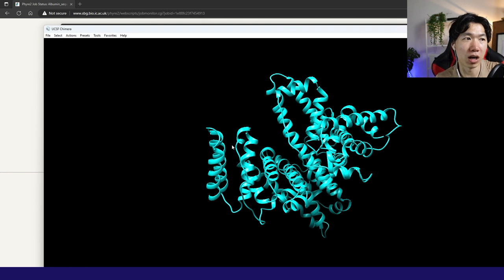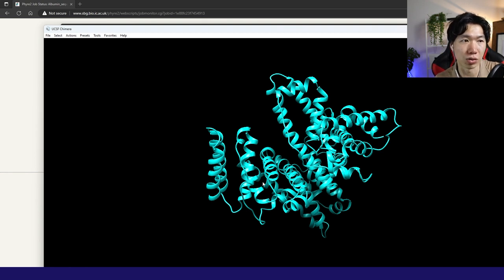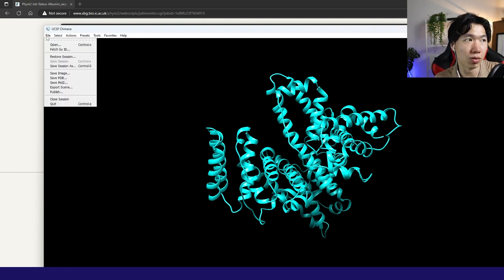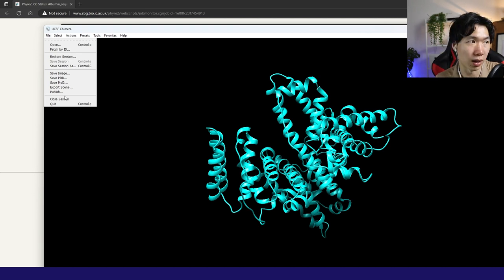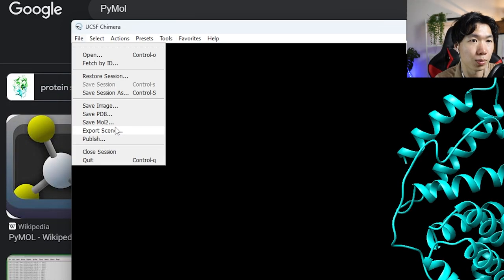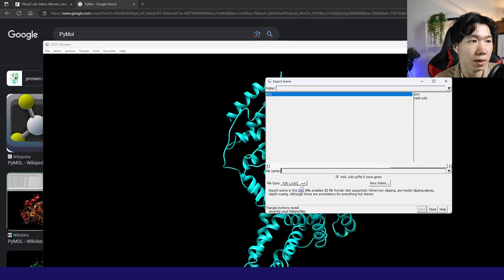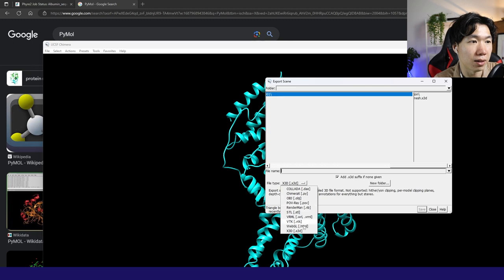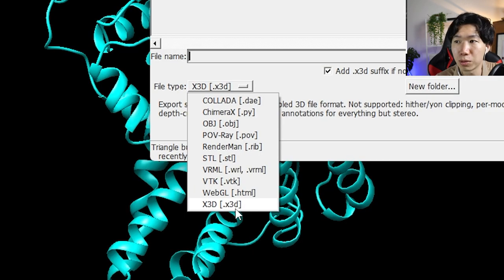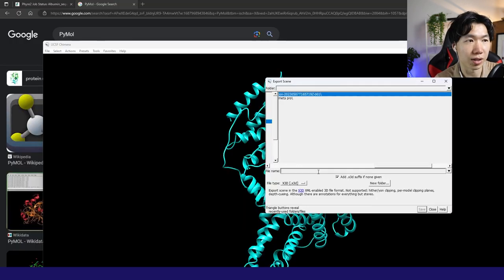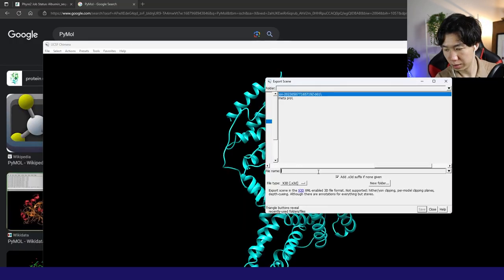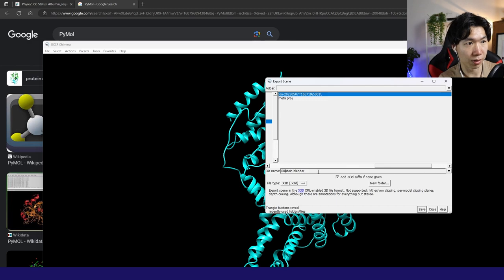If I want to further color it, for example, I only want to color some parts, I will put it in blender to work on the models. Export scene. And make sure you choose the file type X3D. Let's name it protein for blender.